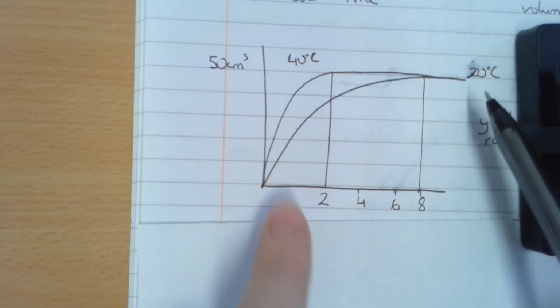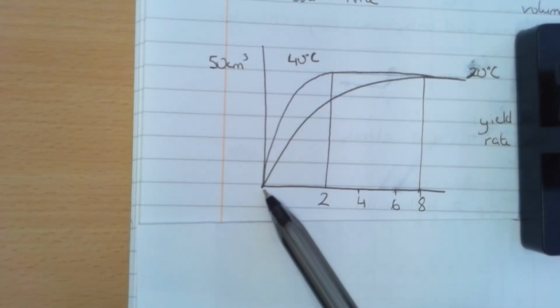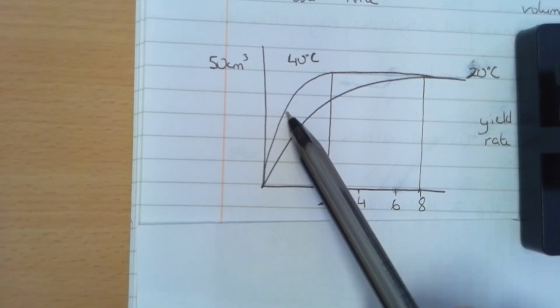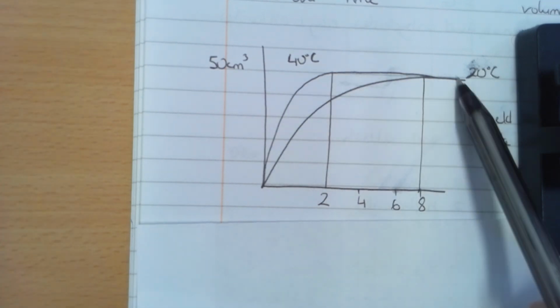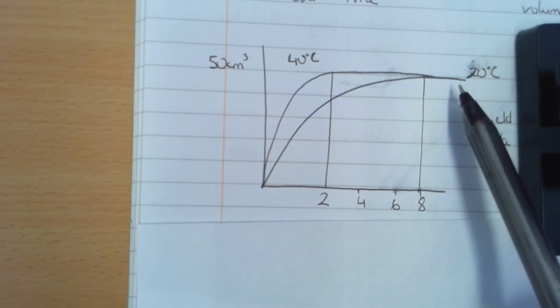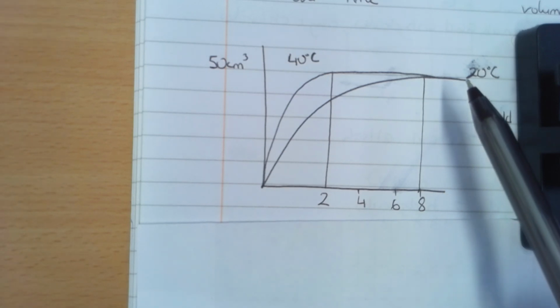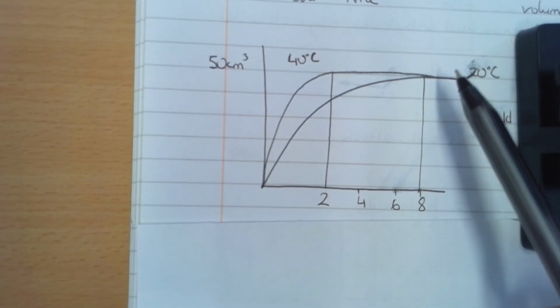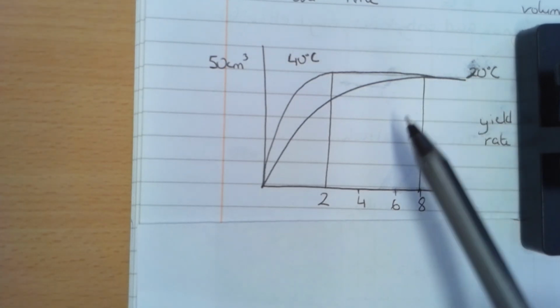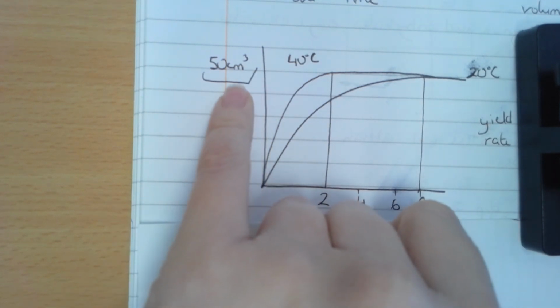So I've got two peaks here. I've got 20 degrees and I've got 40 degrees. And you can see that the 40-degree one is steeper to show me that it's faster, but that they both level out at exactly the same place. This tells me that the yield is the same. Okay, so remember, if you're baking a cake, baking at a higher temperature doesn't give you more cake, you just cook the cake quicker. So both of them should level off at the same point, and I'm saying they both produce 50 centimeters cubed in total.